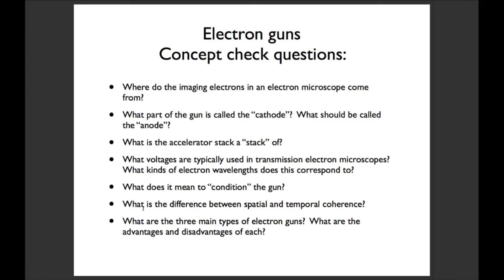What is the accelerator stack a stack of? A series of disks with holes in them connected by a series of resistors, creating a graded potential.